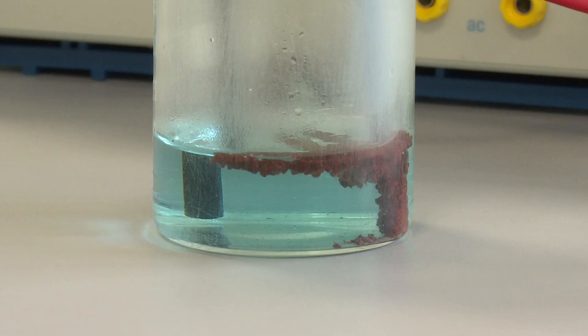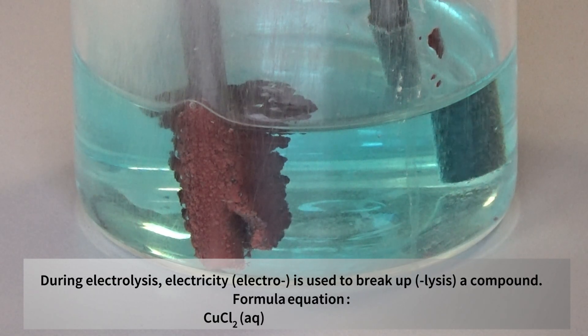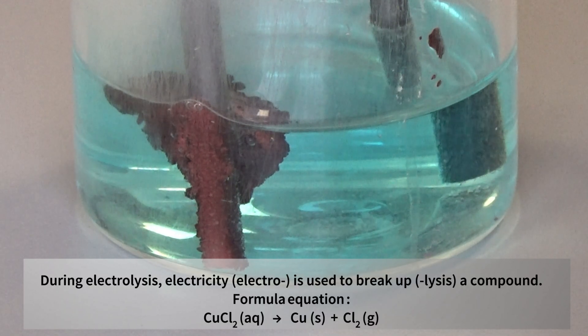At the negative electrode we have got a solid formed, and the solid formed is copper. The copper ions from solution — the positive copper ions — have been attracted to the negative electrode where they've gained electrons to form copper atoms. So copper has been formed.